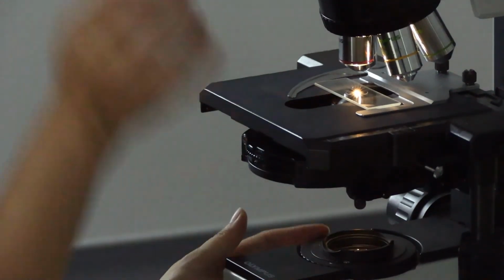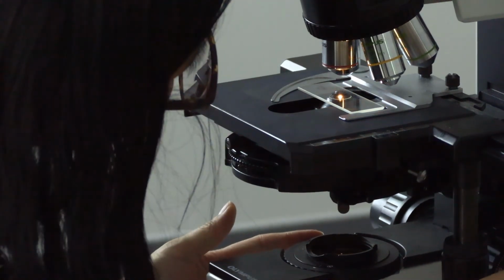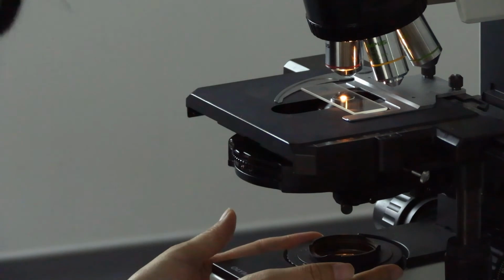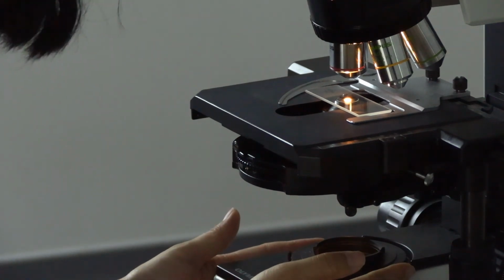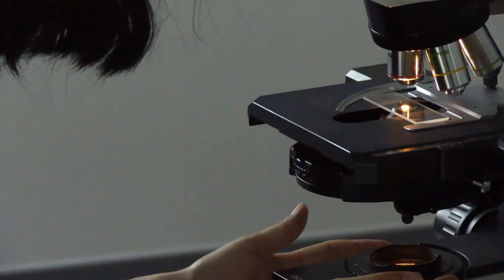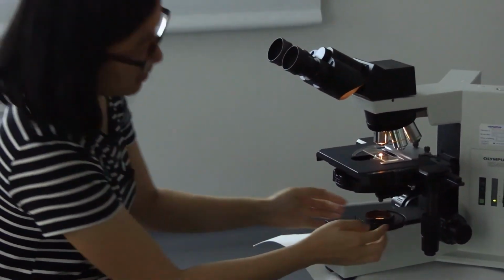When it becomes sharp, I need to reduce the light a little bit. Try to increase the iris until the edge of the pattern just touches the circle of the light.